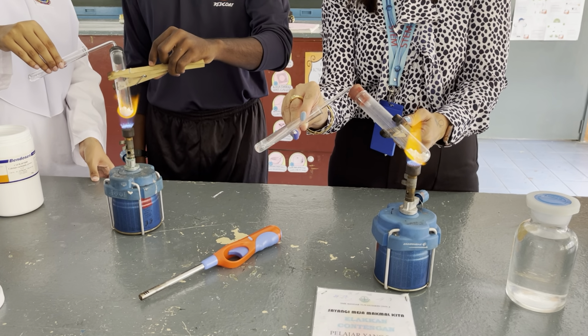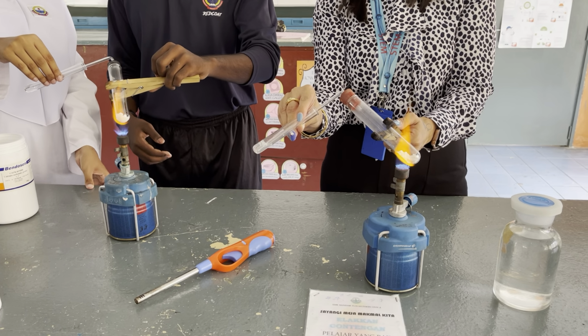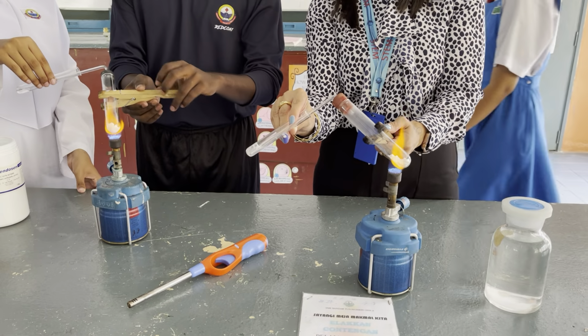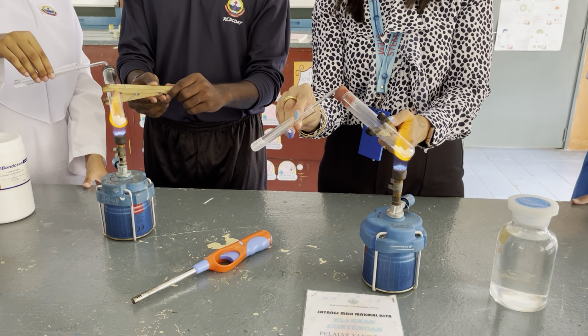Can you see anything changing? Yes. Okay, what can you see? Tell me, what's your observation? What can you see? It turns cloudy. Turns cloudy. Very good, Adriana.